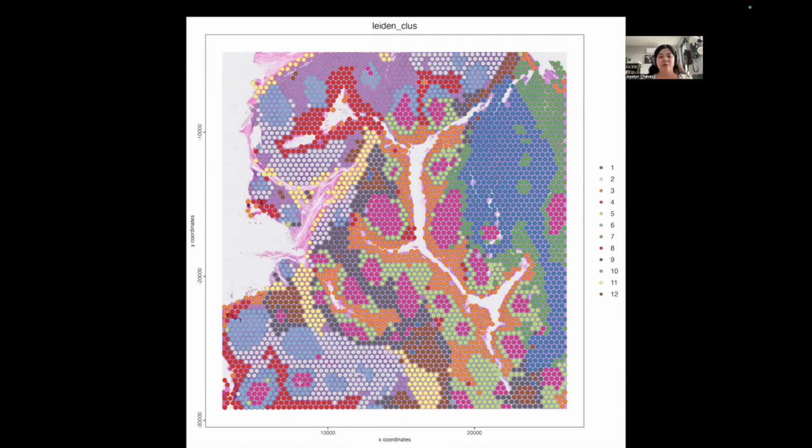We were able to capture, for example, for this circle over here, the inner section, which we were not able to capture using the RNA, if you remember that plot. So for this circle, we were able to capture in the RNA the circle structure and the boundary, but not the inner section. Now with the protein, we can capture the inner section, but not very well the boundary. The same thing over here, right?